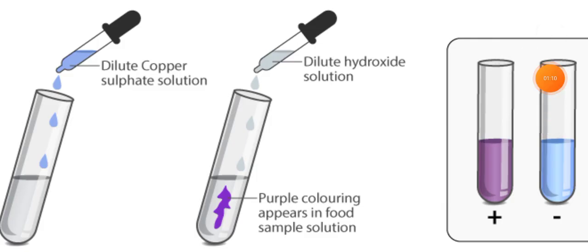Now let's see how to find whether there is protein in the food or not. The materials you require is food sample, any food sample you can take, water, test tube, copper sulfate and caustic soda. Take grinded food sample and add 10 drops of water.